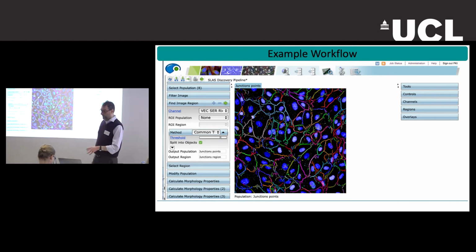In the work we have done previously, we simply, it's not really simple, but we did it, counted the number of these objects for each cell, which is a method that can be implemented in Columbus. It's not very complicated once you can find the object. And the numbers that we defined, we found out, were correlated to the continuity of the junction, which is what our eyes see by experience.